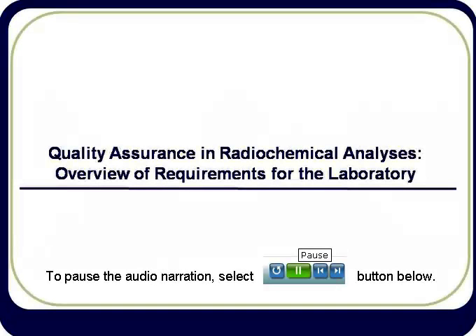Module 7.1, Quality Assurance in Radiochemical Analyses. Overview of requirements for the radiochemistry laboratory.